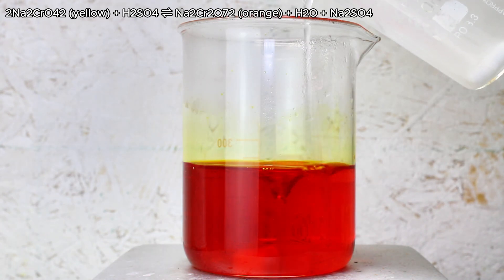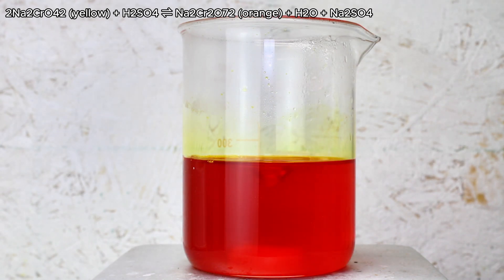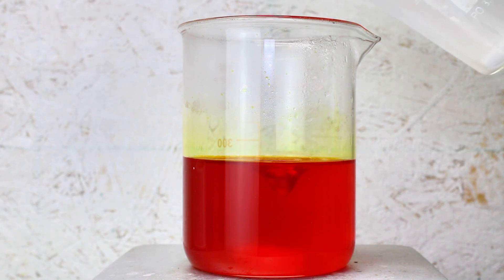I then added some potassium chloride, and once it had thoroughly mixed for a while, I left it overnight to allow the potassium dichromate crystals to form.